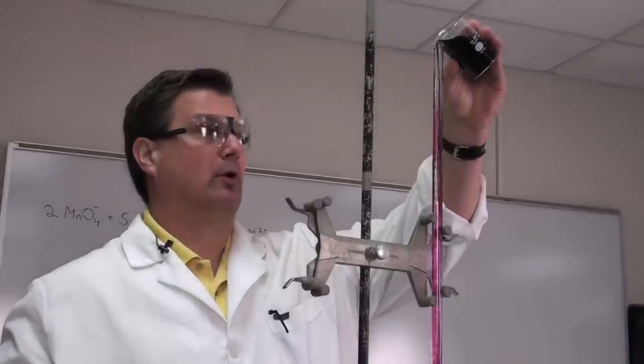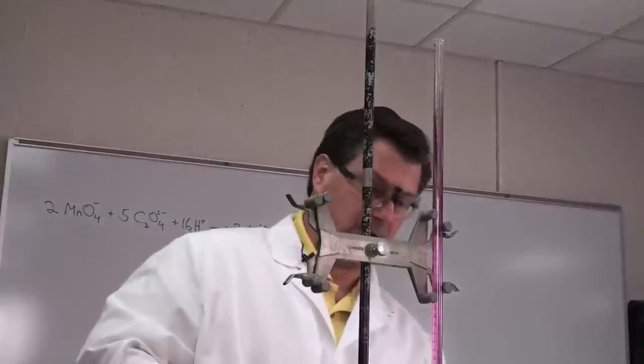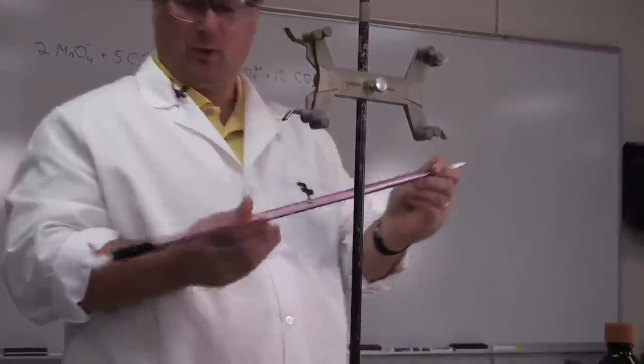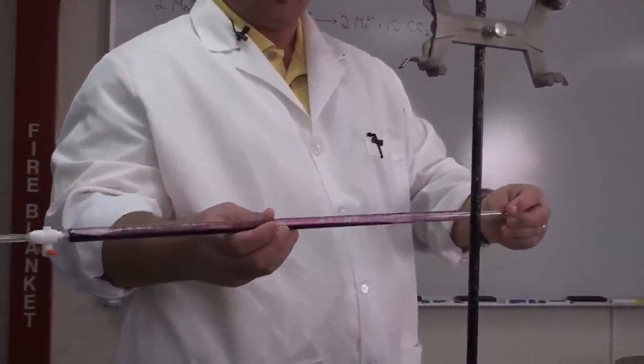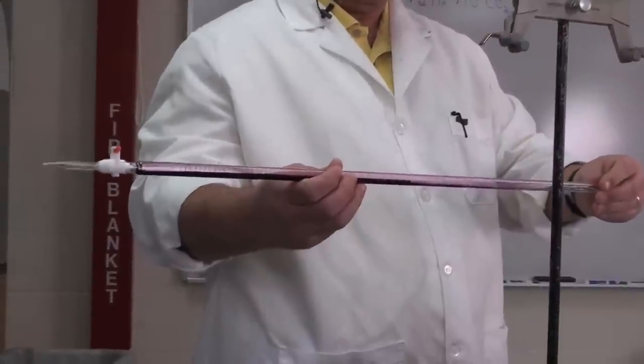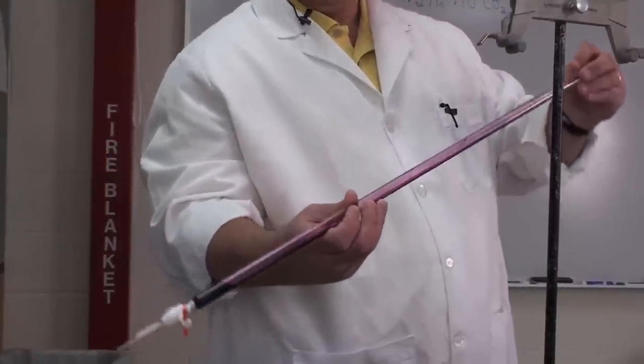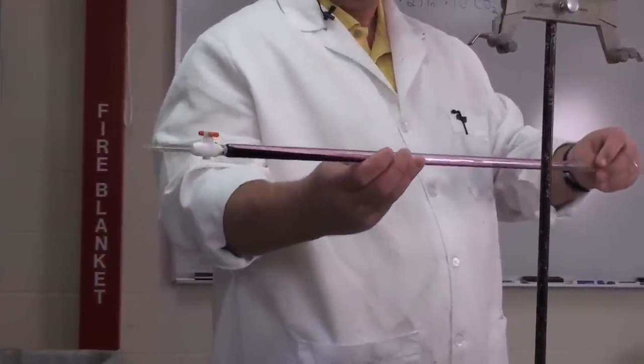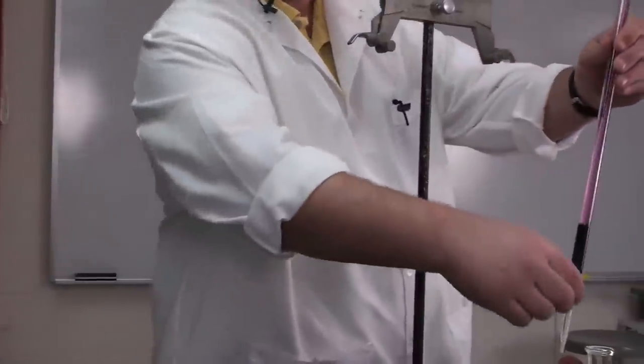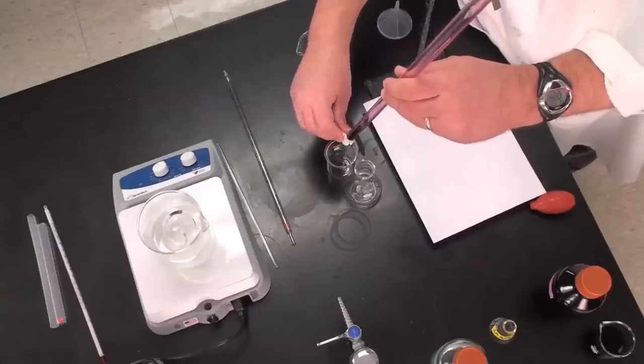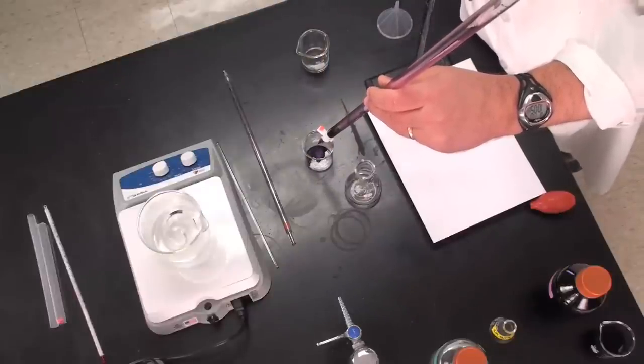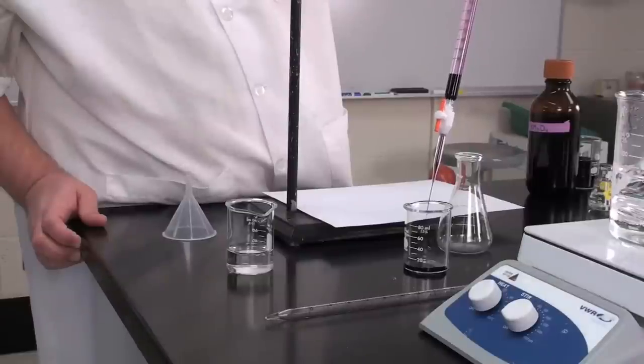I'm going to pour a few milliliters in there, not very much. The purpose is just to rinse dust or anything that might be in there out. You tilt it almost horizontally and spin it around, coat the inside of the burette with the reagent, which we call the titrant. Then we get rid of it—this is going to be discarded into this other beaker through the stopcock.